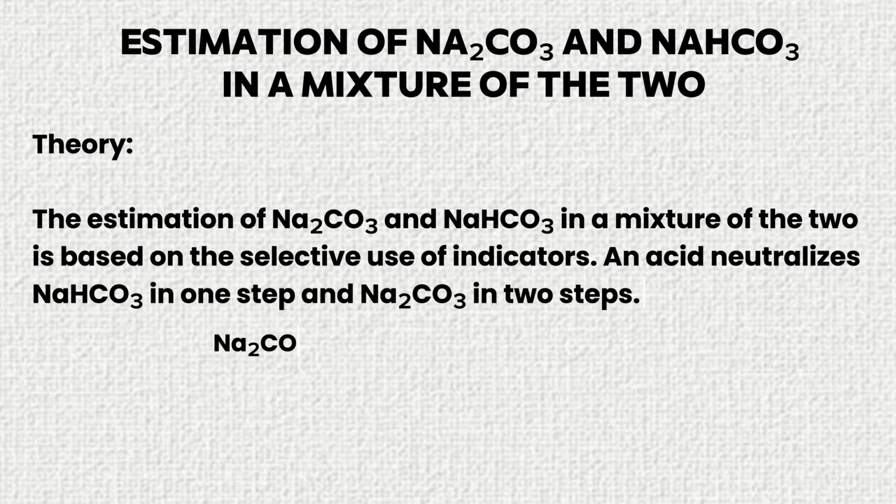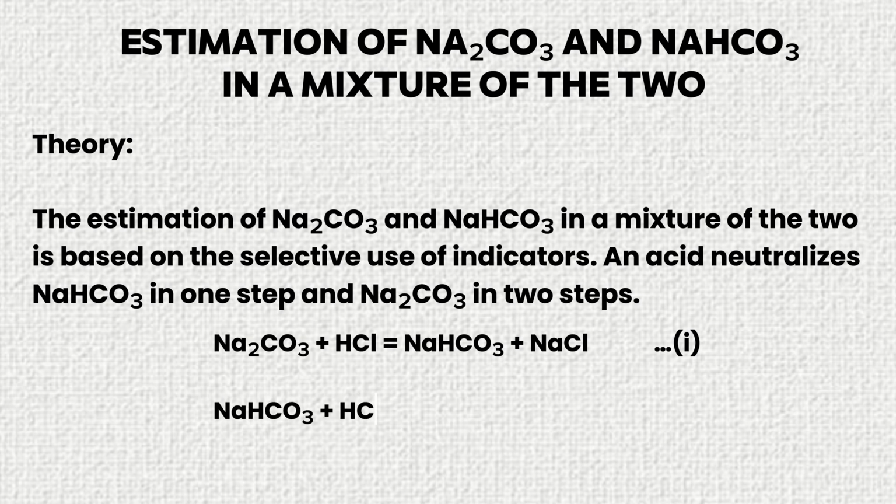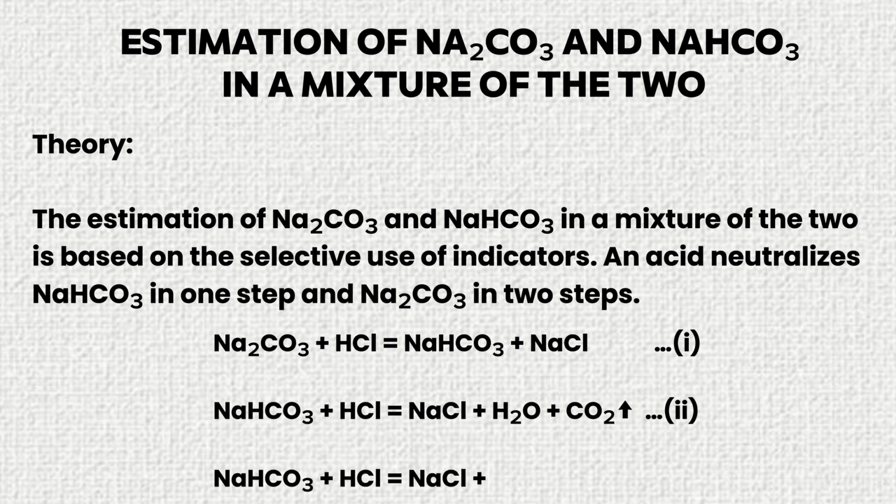One, sodium carbonate reacts with hydrochloric acid to form sodium bicarbonate and sodium chloride. Two, sodium bicarbonate reacts with hydrochloric acid to form sodium chloride, water, and carbon dioxide gas. Three, again, sodium bicarbonate reacts with hydrochloric acid to produce sodium chloride, water, and carbon dioxide gas.